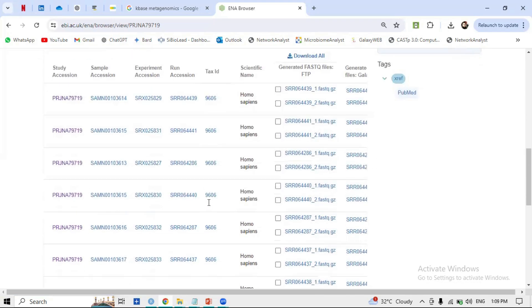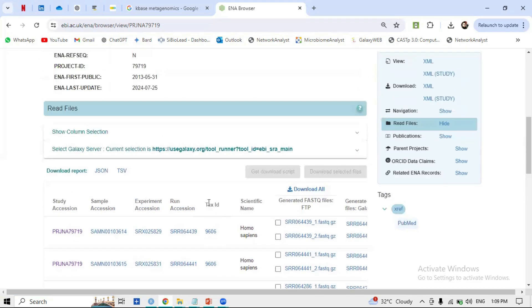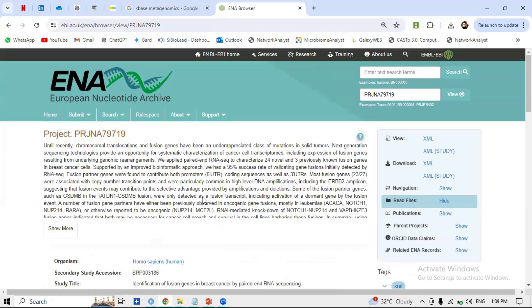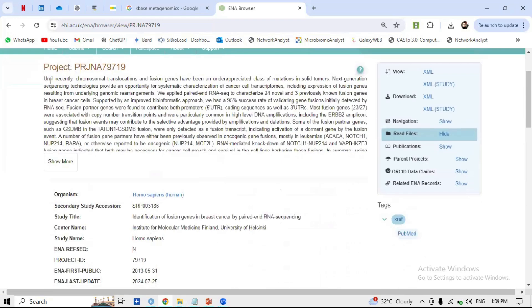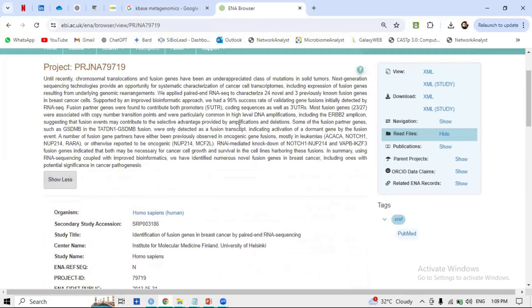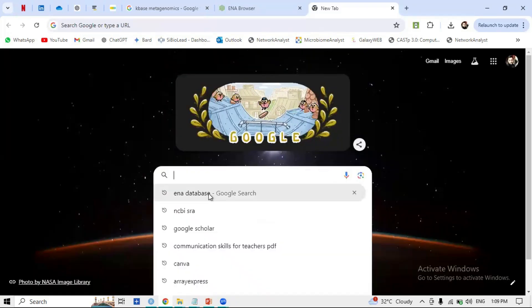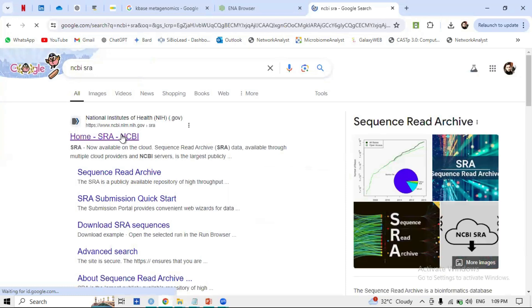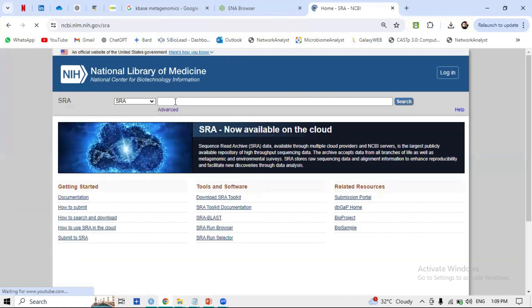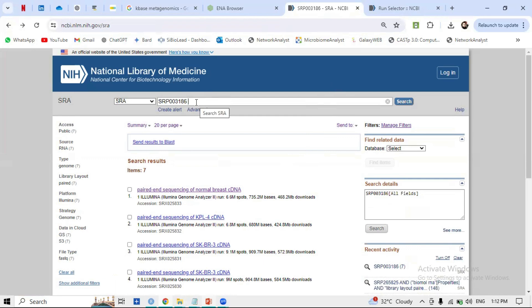Now it's hard to find the phenotype and metadata directly in ENA. As I mentioned, you can go to the project description, but for easier understanding, copy this accession number and go to NCBI SRA. I told you earlier these databases are interlinked. Type the accession number in NCBI SRA and search. To explore further, click 'Send to SRA Run Selector.'